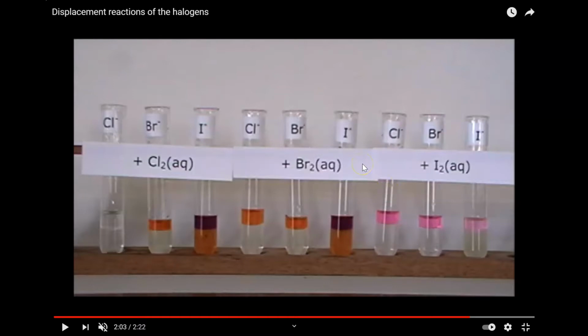All right, so you should be able to figure this out. I already know that I2 is less reactive than bromine, so I don't have to worry about that one. This is just my control. So bromine is brown. If I see brown in the top layer, it means I've got bromine. So when I combine chlorine with bromine, I find out that bromine is less reactive than chlorine. So it looks like I2 is the least reactive. Bromine is more reactive than I2, but less reactive than chlorine. I've already figured out the sequence.